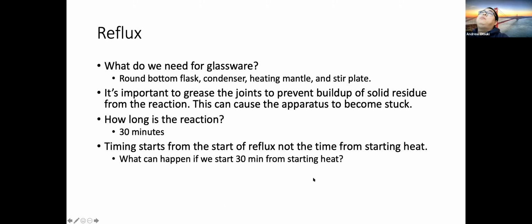So what can happen if we start from 30 minutes? Well, our yield could go down, and that would not be good because we wasted time, wasted material, and now we have to go back and do it. All right, so we always want to stick to our directions and just think logically, what should we do?